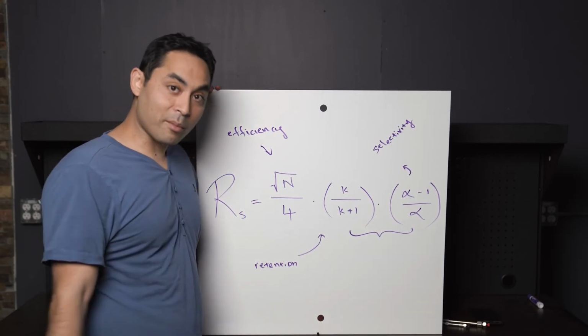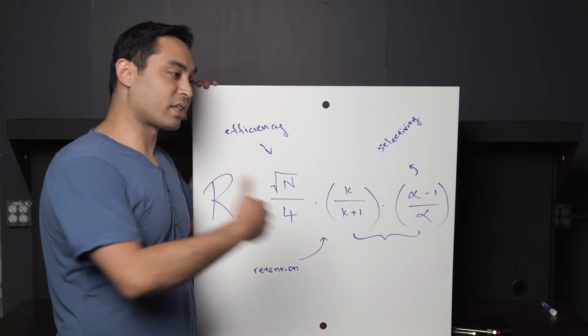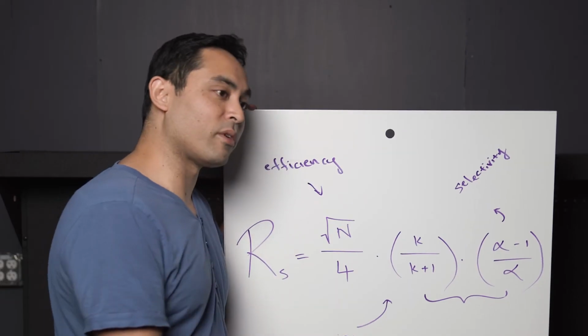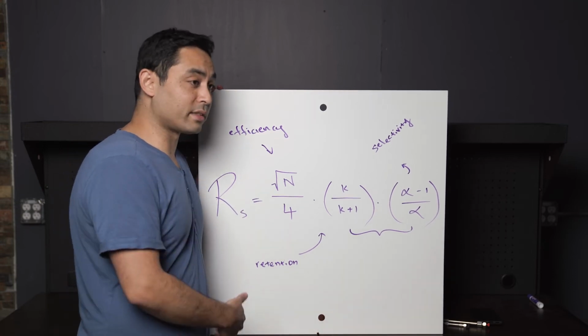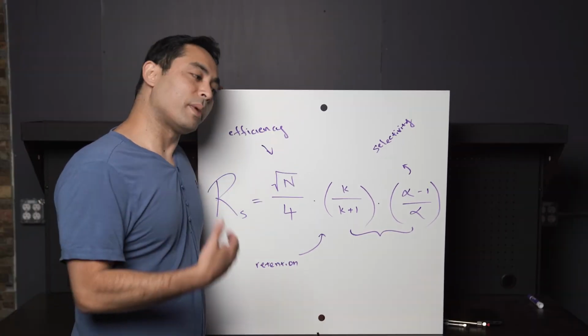You also have to be a lot more careful with sample prep. You've got to have much cleaner samples. You have to filter a lot more. And then maintenance costs. It'll cost you more money to maintain a UHPLC system. The PMs will cost you more. But if you need it, you need it.